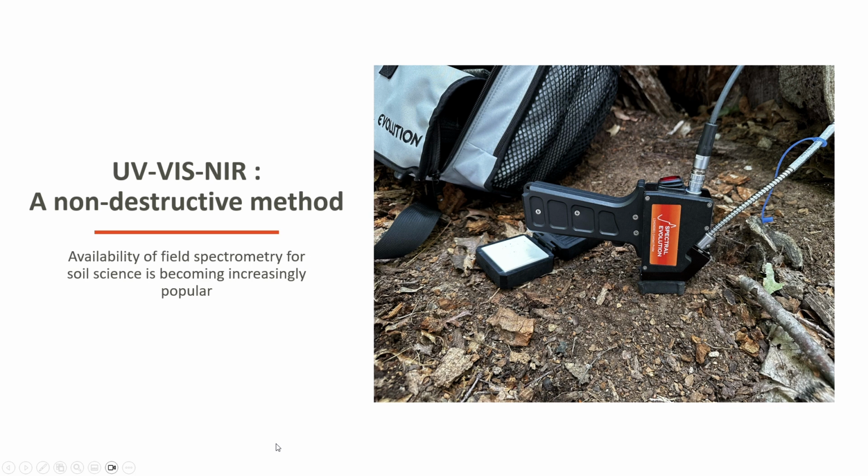Typically, I would suggest the more targeted contact probe measurement. This is in part because the light bulb inside of it has a very high energy, and if you're taking samples in dark soils, this will help you bump up the signal and get less noisy data. It also is less dependent on weather conditions when you're out in the field.